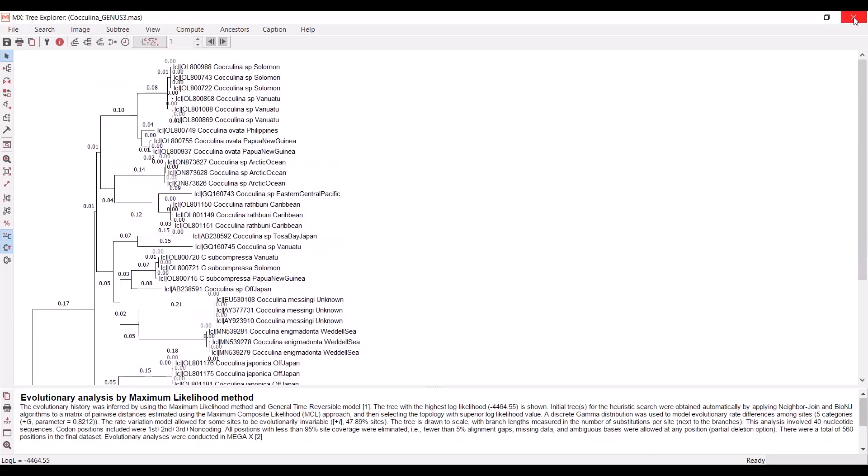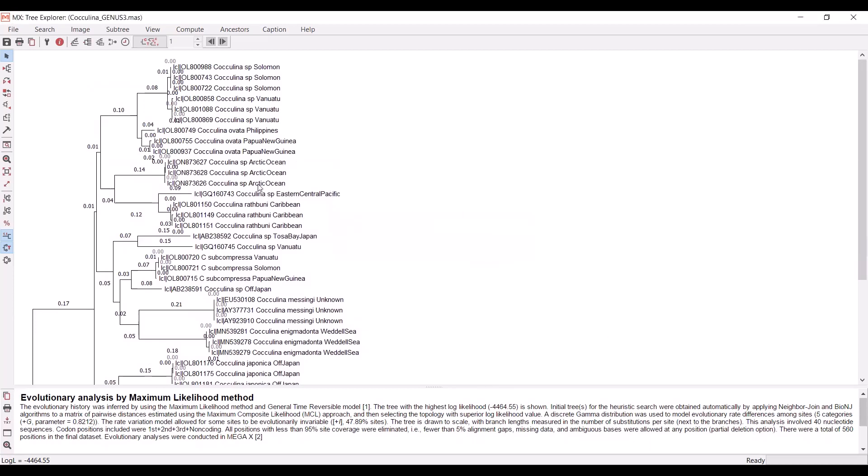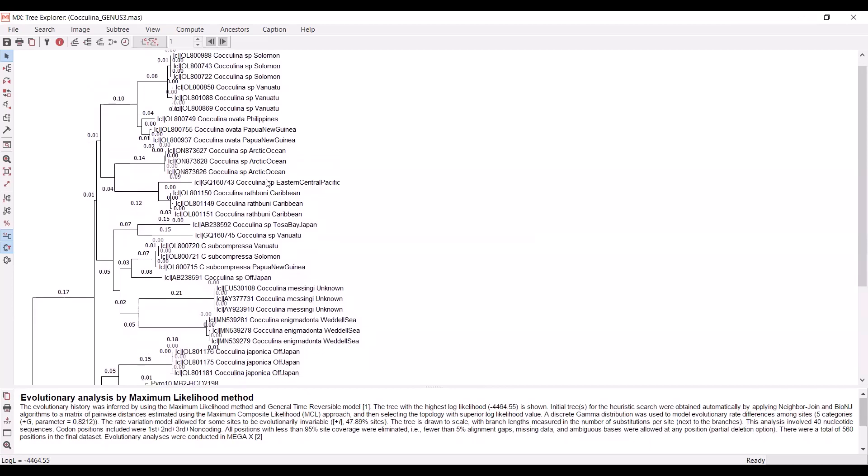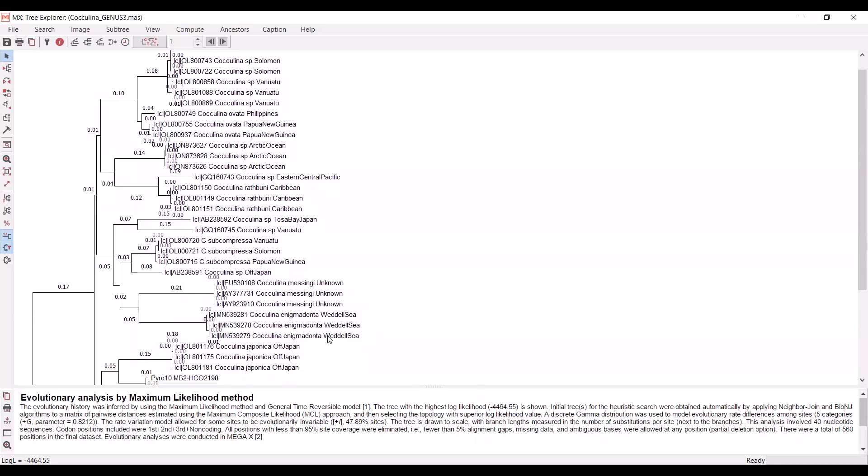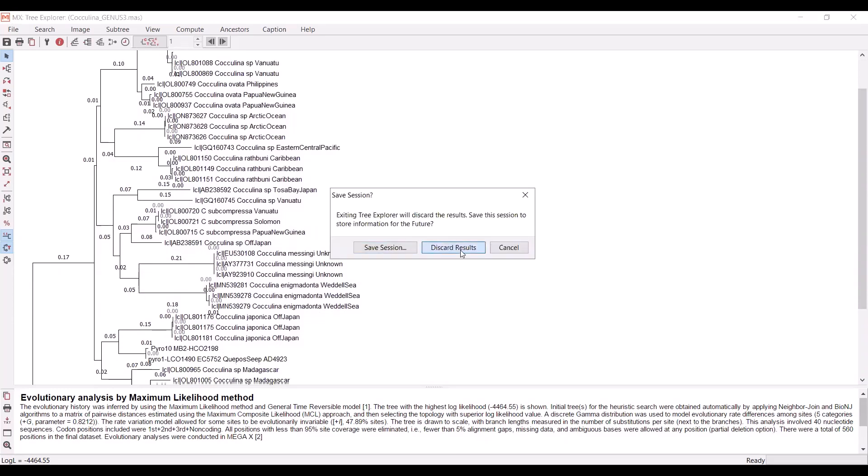I'm actually not even going to save this. You can if you want. But that is just a quick check that the sequences from the Arctic Ocean are, as we expect, grouping together. Things from the Weddell Sea are also grouping together off Japan. This looks like what I would expect, knowing where these sequences came from and what species they represent. So I'm going to discard these results.